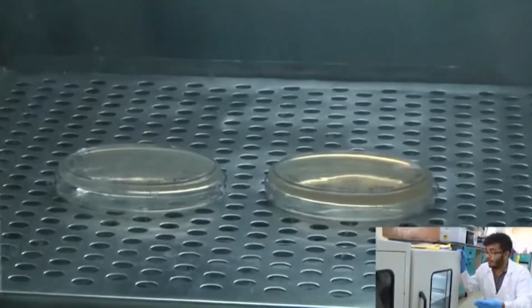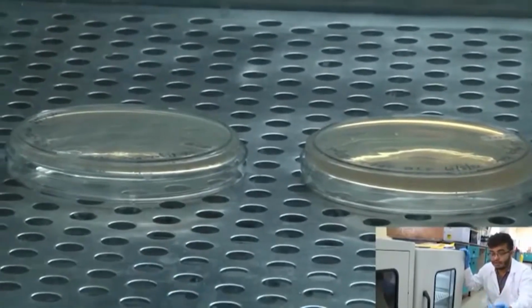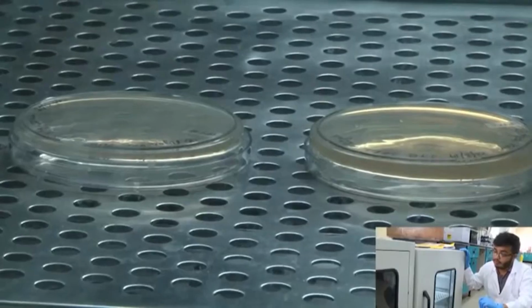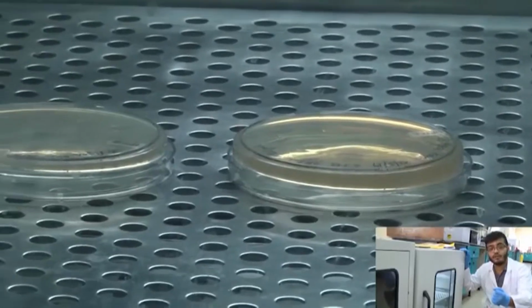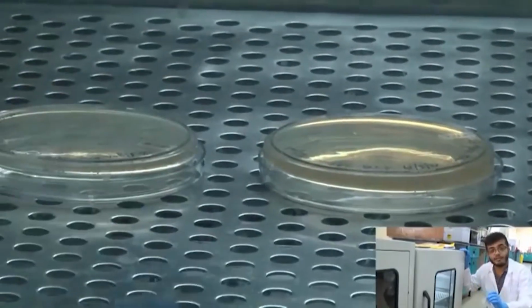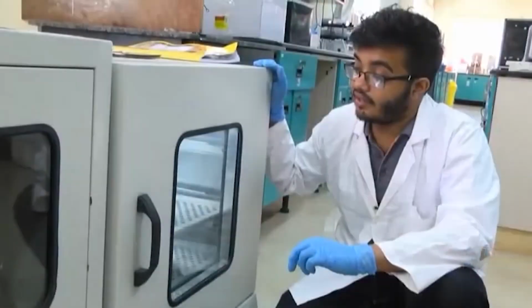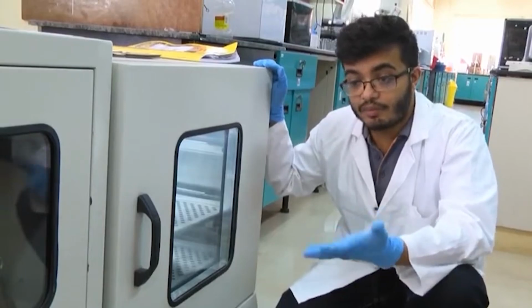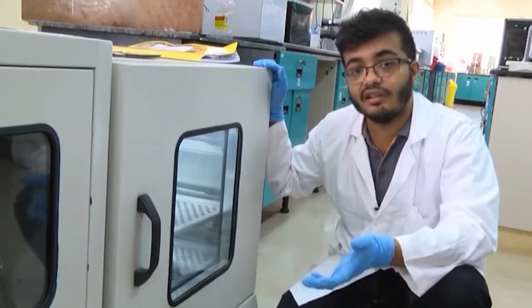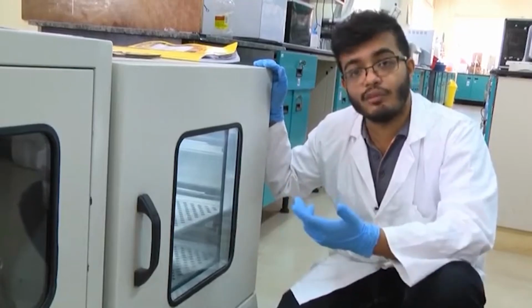Another reason could be that they were competent, but while handling them, before adding DNA, maybe while taking them out from the minus 80 degree centigrade fridge, we kept them in our hands for too long, and therefore we messed up the competence of the cells. Another reason could be that while plating, the spreader was too hot and we killed the bacteria. So, there could be many different reasons if we do not get colonies, and we will have to troubleshoot them subsequently.